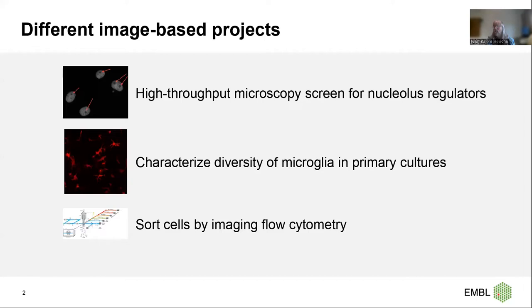At EMBL, we're dealing with a range of image-based projects. I'm listing here three examples of projects I've been involved in, going from image-based screens to characterization of cells in primary cultures, and more recently, an imaging flow cytometry project.